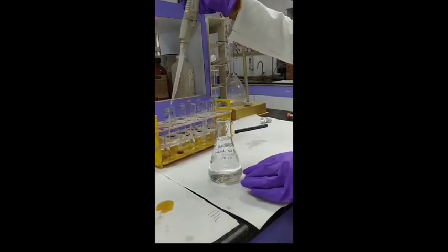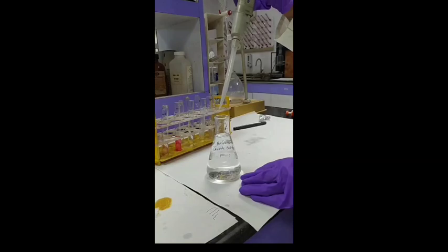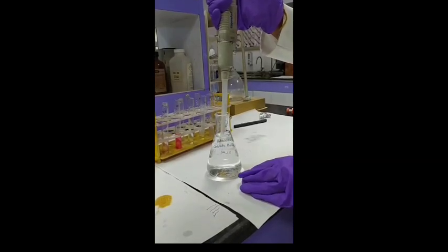Similarly, we are going to add 4 ml of potassium chloride buffer adjusted to pH 1 in another test tube of the sample and in another blank.